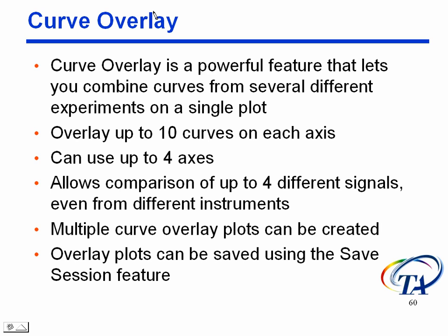Now, it's important to remember that an overlay plot is actually just a new window that UA is tapping data from existing windows into. It doesn't actually exist. It's not really a file that you open up and create or anything like that. It's just a window which goes and snatches the data from various other files that are already open. So in order to save an overlay plot, you have to use the Save Session feature. And I'll get into that in a minute.